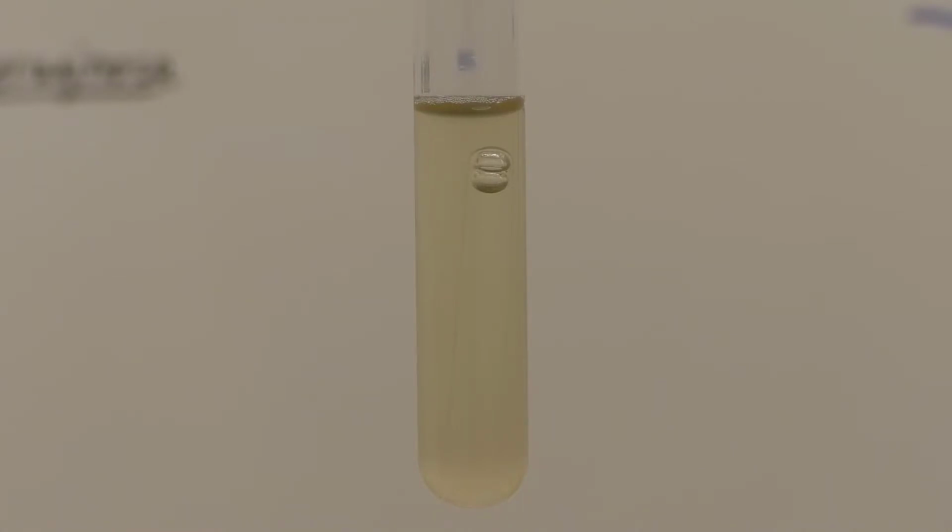If it produces nitrogen gas, that nitrogen gas will accumulate in the Durham tube, as you see in this tube with Pseudomonas aeruginosa. So what we want to do is test each of these media for the presence of nitrate. And we might predict that in this case we wouldn't see any nitrate because we see this nitrogen gas. So let's do the test for nitrate.